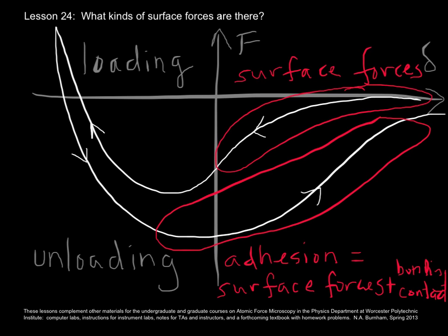I've drawn the surface forces as attractive, that is, the cantilever is bending towards the sample during the loading process. However, that's not always true. It is possible to have repulsive forces, although that's less common.